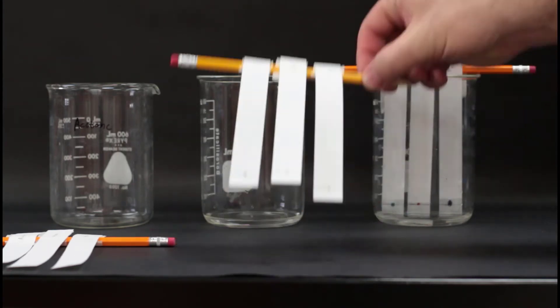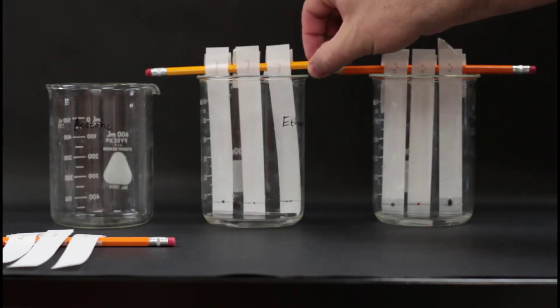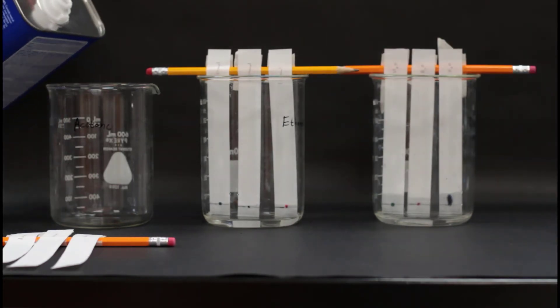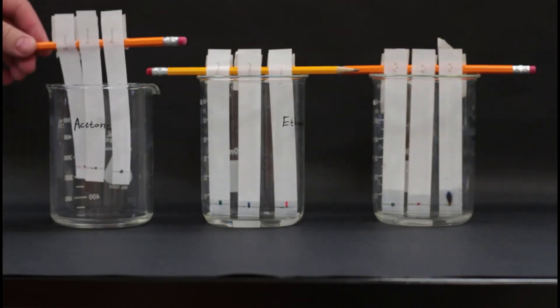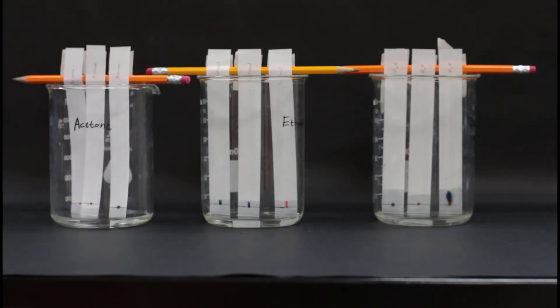Place the chromatography paper into each solvent. The solvent will steadily be absorbed by the paper, traveling upwards. If the ink is able to dissolve in the solvent, it will travel with the solvent. However, if the pigment of the ink is more attractive to the paper than the solvent, it will rise more slowly, and you'll see the different pigments begin to separate.